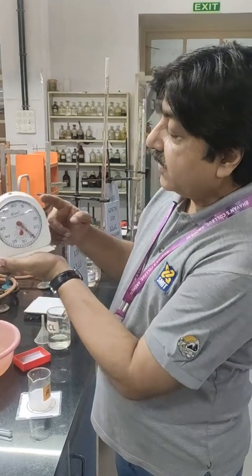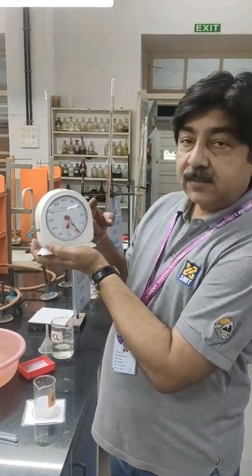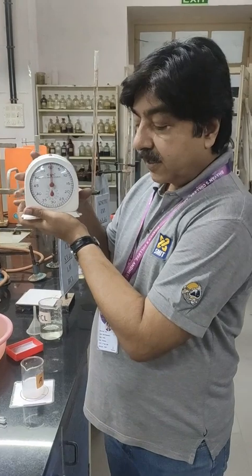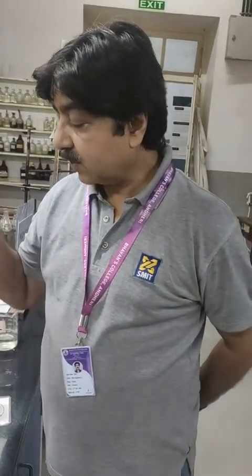Now I will reset it. As I said, how we are resetting, I will press this left hand side arm and you will see that the watch is once again reset. Now we will go for the second set of reading. So now I am preparing the second reading.